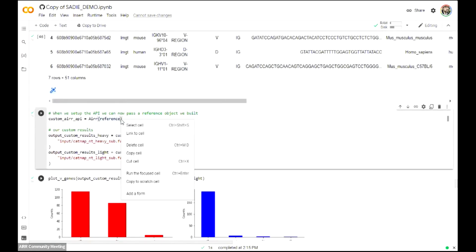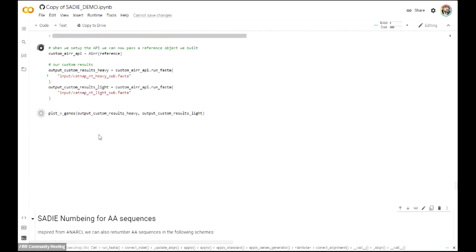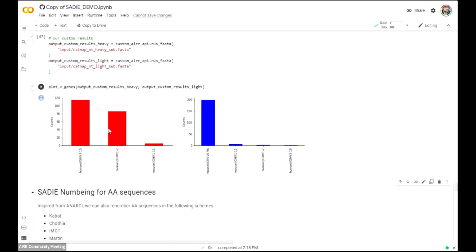And then what I can do is run this again and show you that we can actually annotate from custom databases just like that. Whatever sort of chimeric mouse model or human that's missing a certain allele can just be quickly turned into a database.